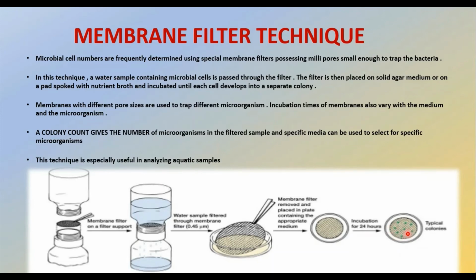After the incubation is over, colonies are found to develop upon the filter disc, and the characteristic colonies of different bacteria can now be studied to determine the water potability. So this is what happens here, and this technique is mainly useful in analyzing aquatic samples.